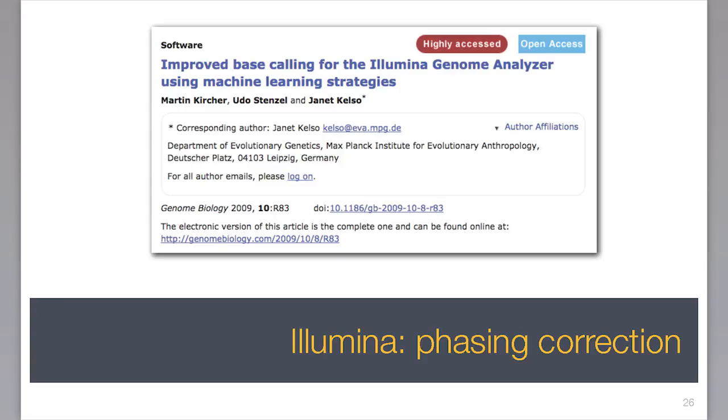You can set training sets, you can simulate data, you feed that into different systems. A couple of cyclic hidden Markov models have been used for that, but also SVMs. Nowadays, you don't realize that those things exist anymore because Illumina just incorporates them into their standard software and they get adjusted automatically for it.